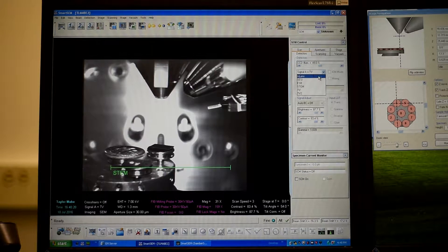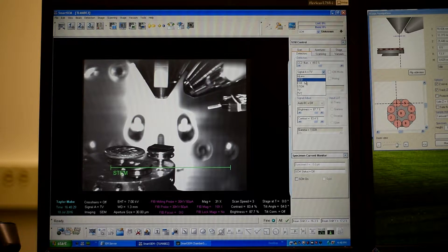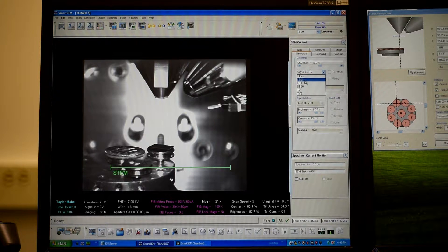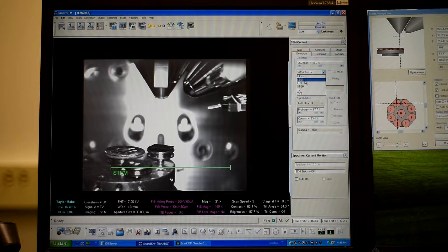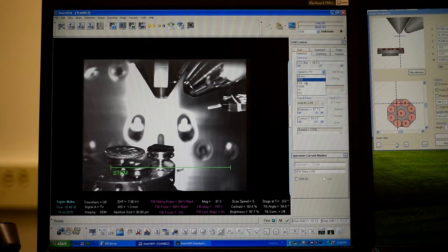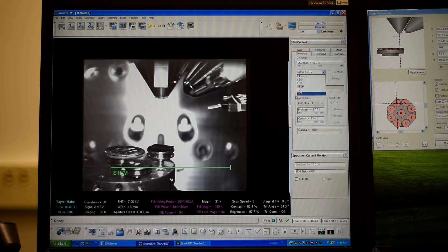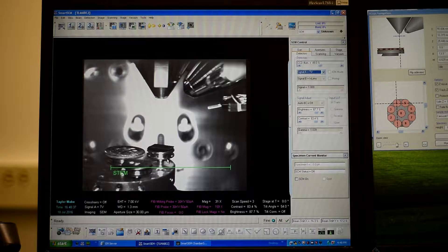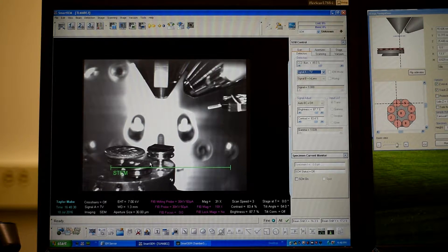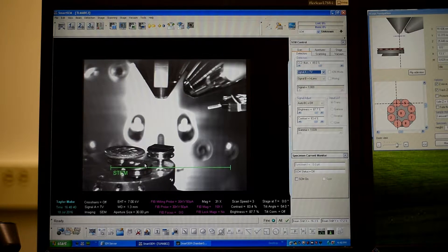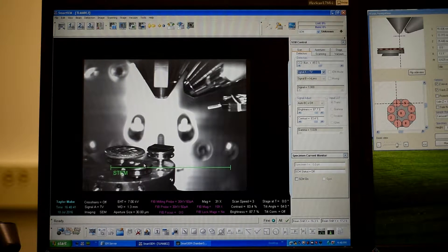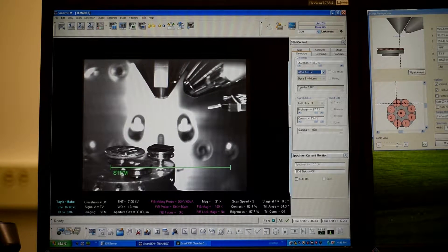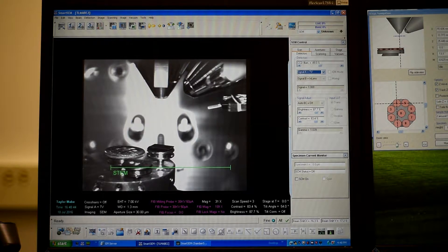And anything longer than that, I would typically use the SESI, which is secondary electron, secondary ion. But we'll leave it on the TV for now and actually decrease the working distance by bringing the sample holder up.